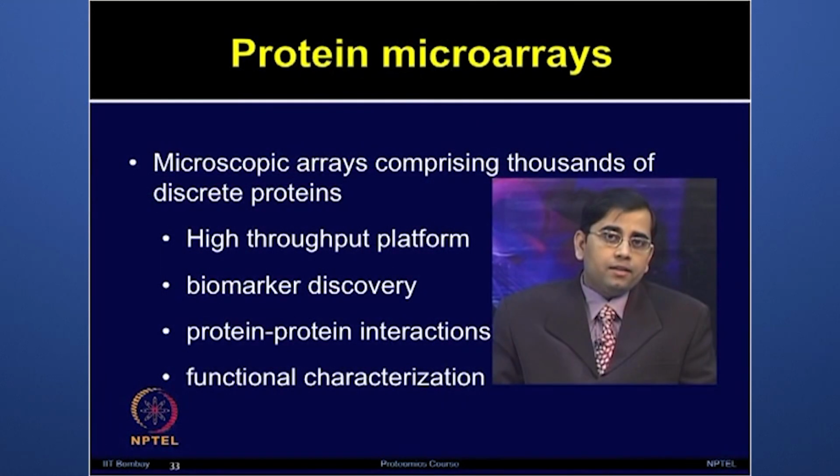Protein microarrays are microscopic arrays which comprise thousands of discrete proteins.